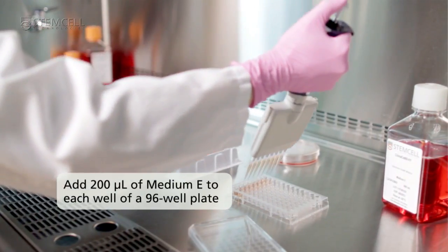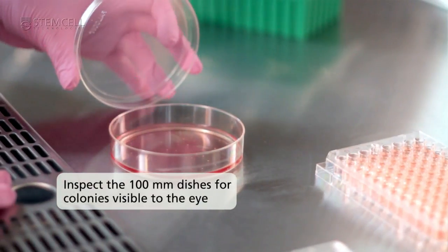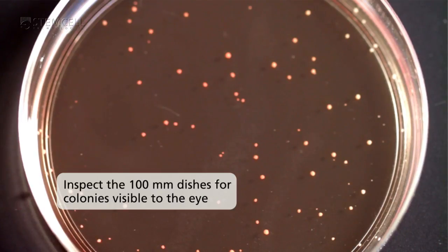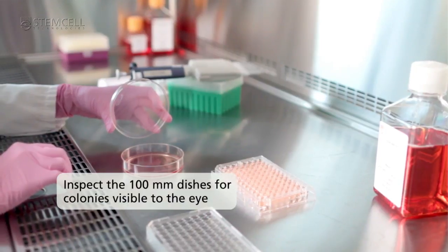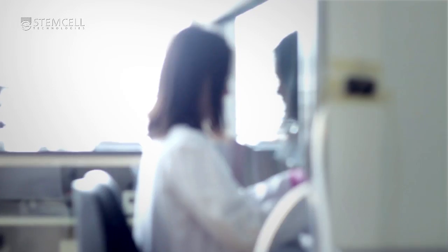Prepare 96 well plates by adding 200 microliters of medium E to each well. Inspect the 100 millimetre dishes for colonies visible to the naked eye. Be careful not to move the plates abruptly to avoid disrupting or smearing the colonies, which tend to be very loose.